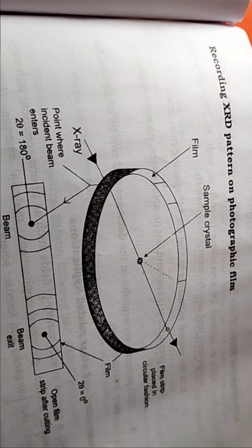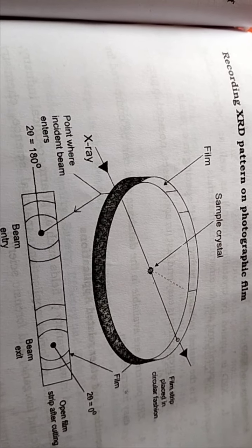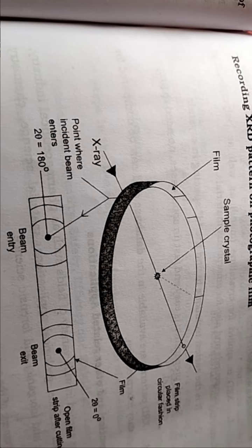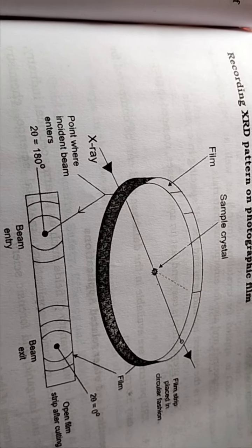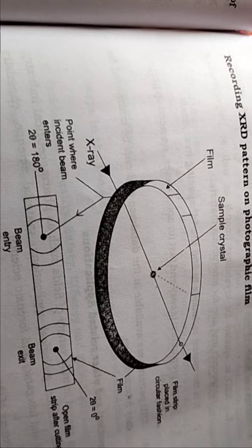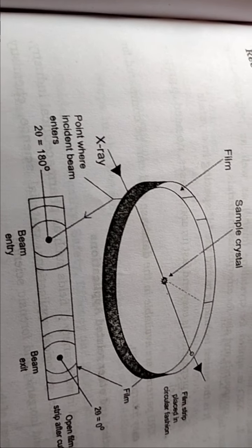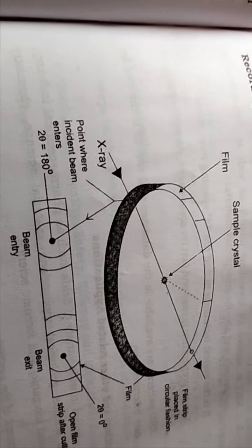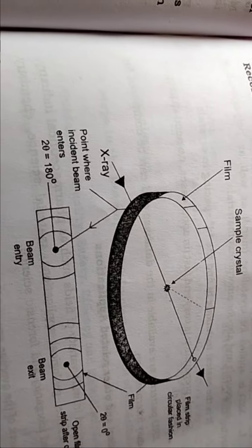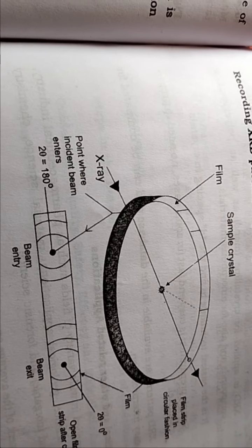Here the detector is not rotated but in a fixed position, and the recorder records the signals, then interpretation occurs. The signal from the detector is recorded and the diffraction pattern is captured on photographic film. This is unique, as we already discussed.